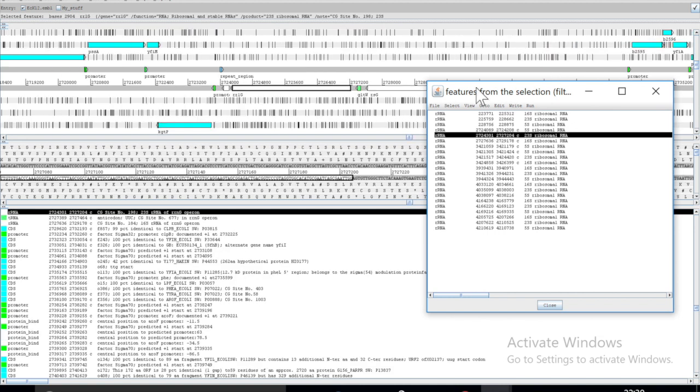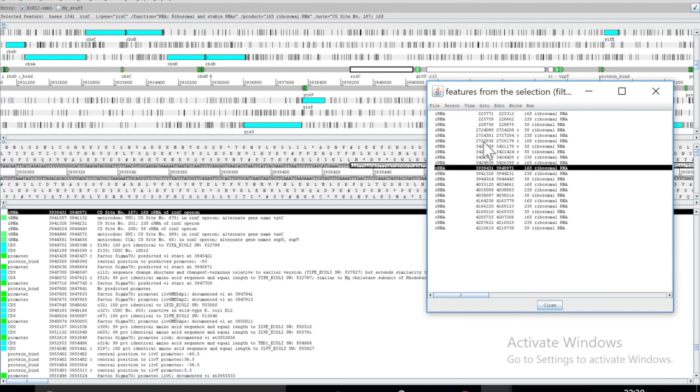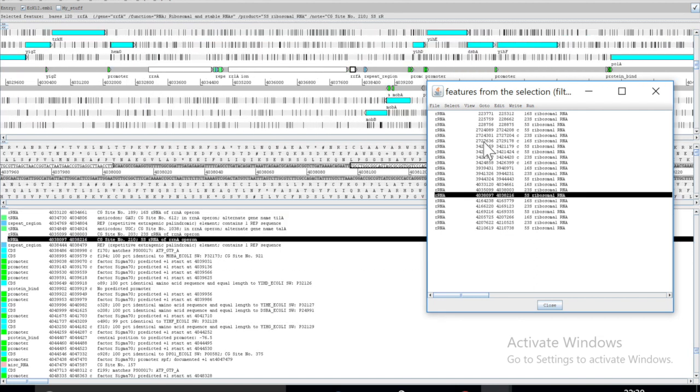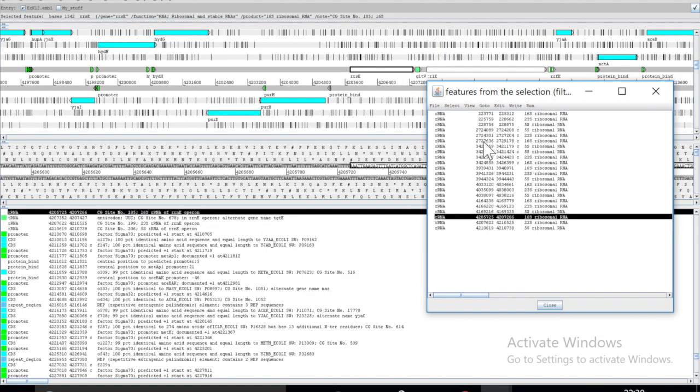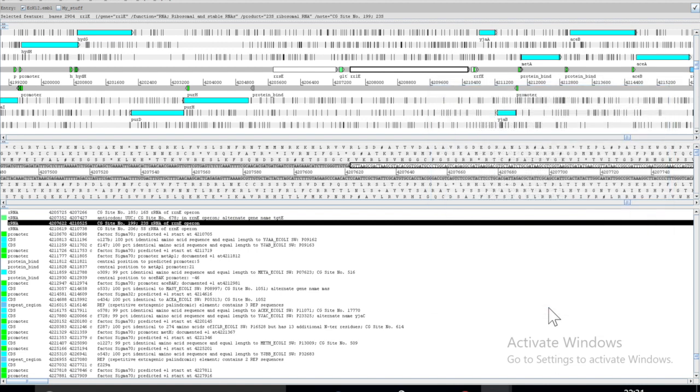And this is incredibly helpful, because that means we can make these selective lists, and then go through the genome with the cursor and actually find out where those different genes are, and look at their location, and take some notes, say for example about the genes that we're finding around these particular sets of genes or types of genes that we've selected. So that's, again, just a reinforcement of selecting genes and having a look for them within Artemis.